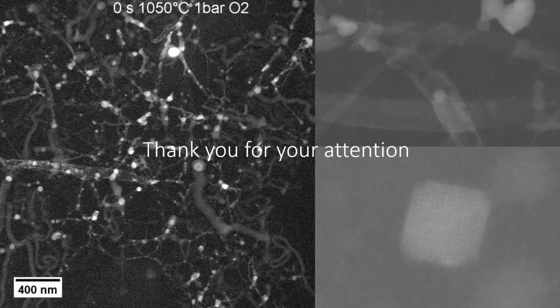Actually, the condition is 1 bar of carbon monoxide and helium gas at 500 Celsius degrees. The TEM is an aberration corrected FEI Titan, 80 to 300 kV. The resolution test was conducted at 300 kV.